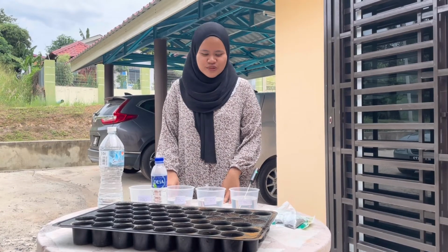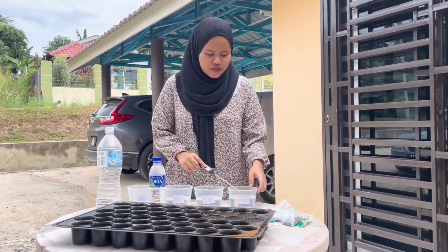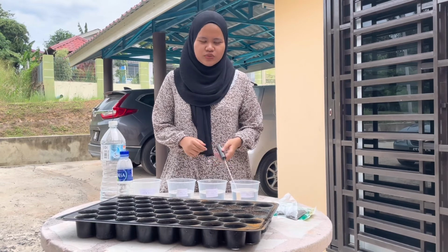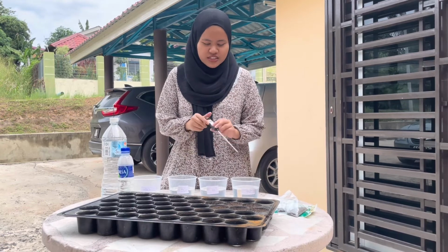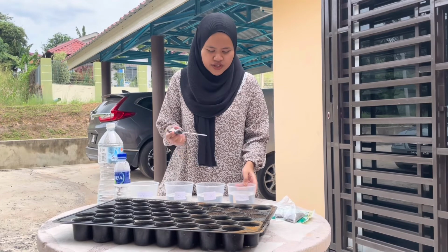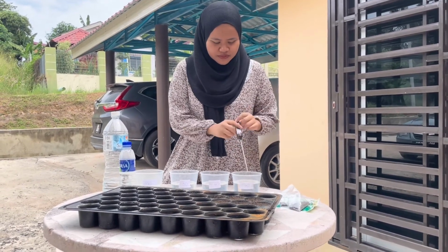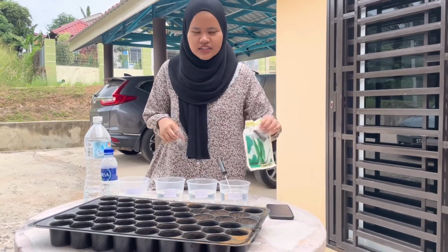First of all, we have to make sure the water is at the right temperature, which is 40, 60, 80, and 100 degrees Celsius. So how can we make sure the temperature of water is right? We can use this thermometer. For example, for 40 degrees Celsius, we can put the thermometer in the water and see the number on the thermometer. And then put the 3 types of seed into the water.